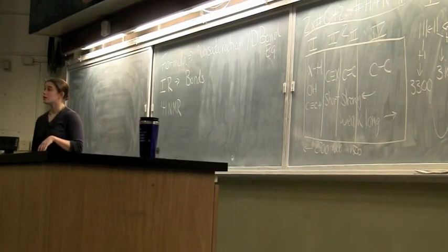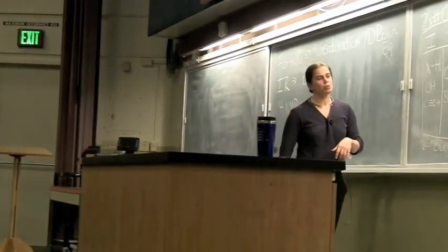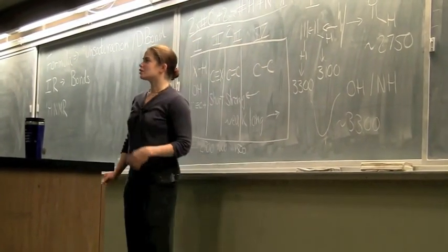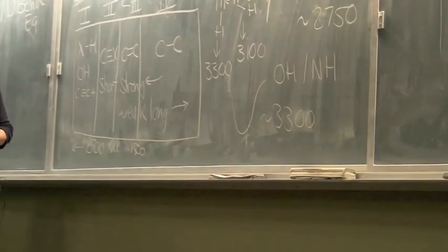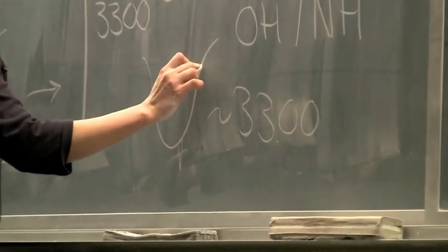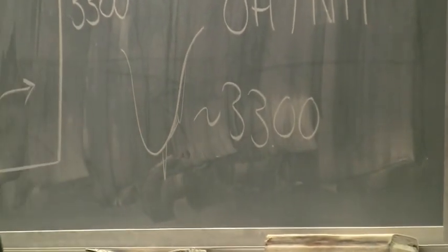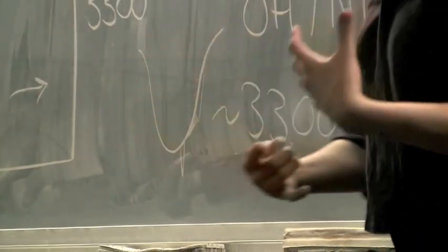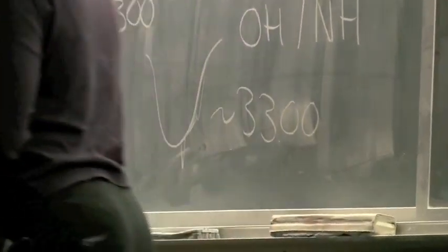How would a triple bond and a double bond affect the OH? So triple bonds with the OH, we can usually see that little spiky bit, because if we have not a terribly strong absorption, we can see that. It's hard sometimes to see double bonds or benzenes because they tend to be on this side and you can't really tell if it's a bond or just a jagged bit on the edge somehow. So those double bonds can often get lost in that OH, which just blurs them out. But the alkynes are usually pretty close to the bottom, so you can usually see them again.